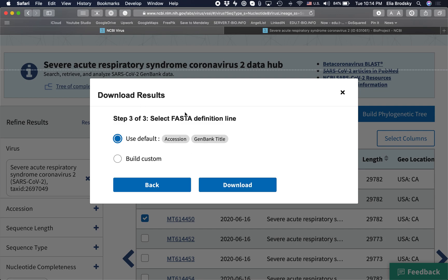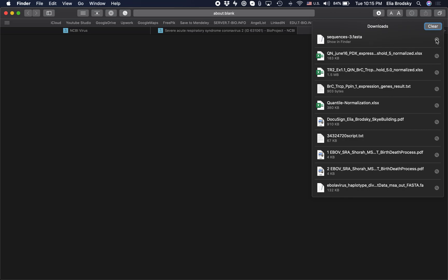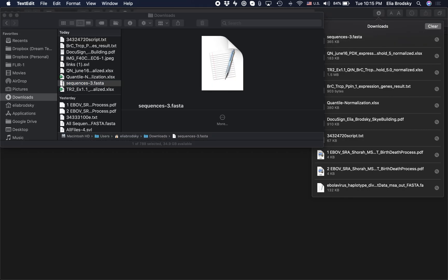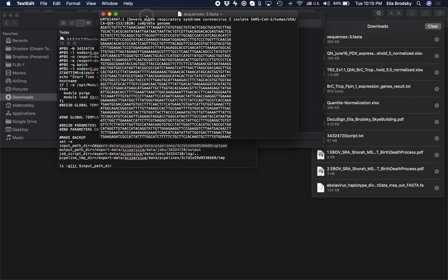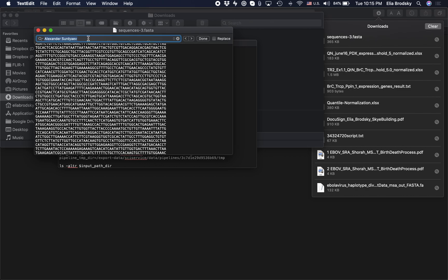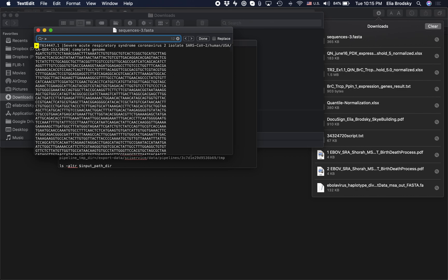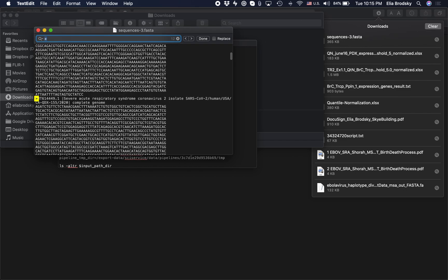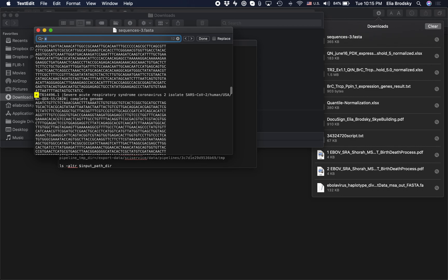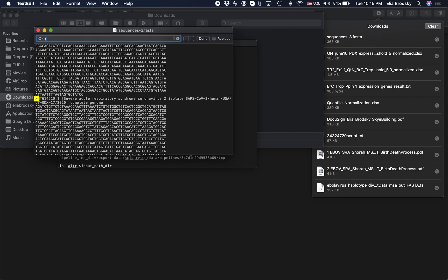Inside the FASTA file, there will be a beginning string containing the accession number and all the information we just saw — including the accession number and GenBank title. You can see all of the sequence data, and we can open it in any text editor. If you do a quick search, you'll see how many sequences you downloaded — in this case, 12. Now you can use these sequences to start your pipeline.